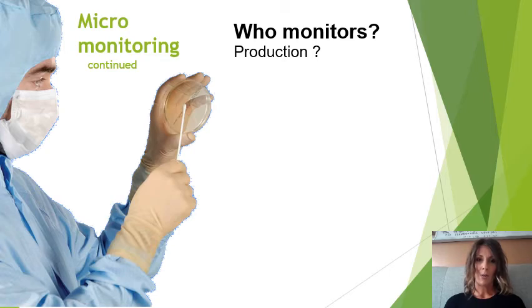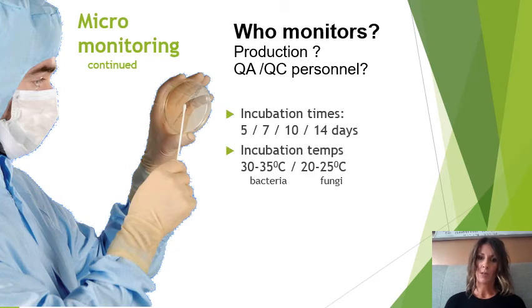This is an ongoing discussion. Who monitors in your clean rooms? Some units are fortunate enough to have an independent quality assurance or quality control team. However, some have to perform the monitoring themselves. So the production team have to do their own monitoring. I'm QA and QC. I've always worked separately to the production units.